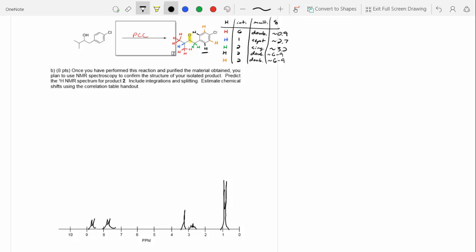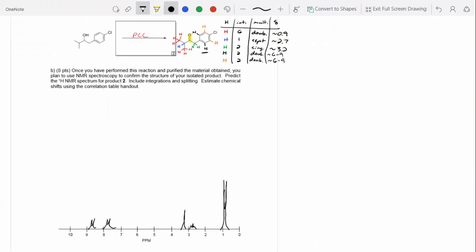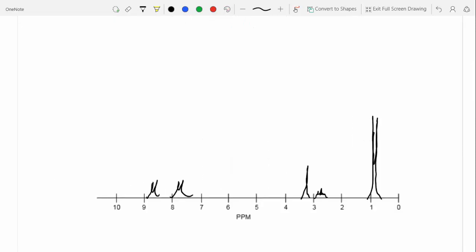Yeah. This is supposed to be a learning process. I don't expect you guys to have been born knowing about NMR, right? Yep. So we put the doublet from 6 to 7 to 7 to 8. That's fine. Yeah, the 2 doublets between 6 and 9 could be any location between 6 and 9. As long as you've got them ballpark identified, that's more than okay.